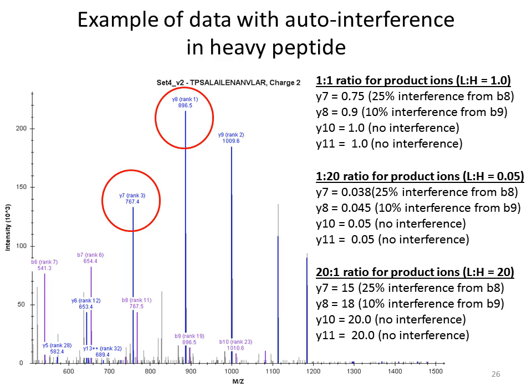And the only way to really get at that well is to do this ratio mixing experiment. But I wouldn't recommend doing 100-to-1 or 1,000-to-1 because that's just a little more challenging to get accurate quantitation on.